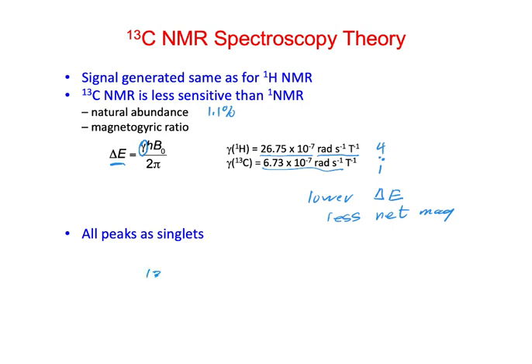So we should see these carbons coupled by the protons, right? But what we do is we do similar to what we did in that selective decoupling, but we do a broadband decoupling. So we decouple all the protons, so it removes the coupling from the protons to the carbons.